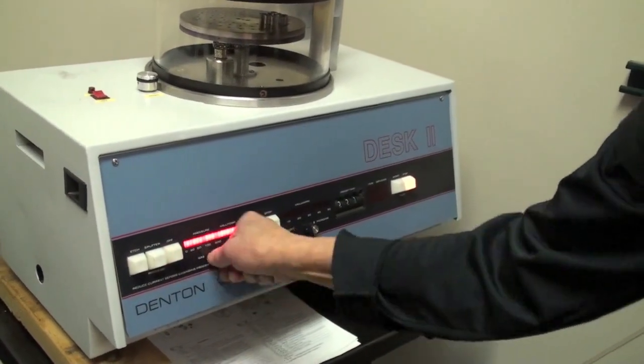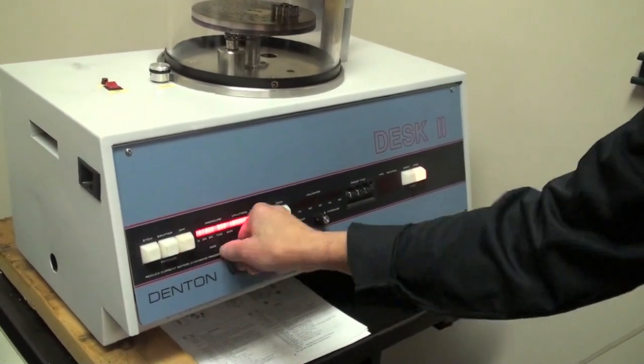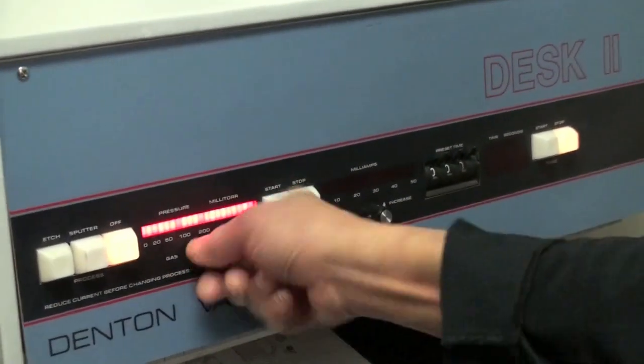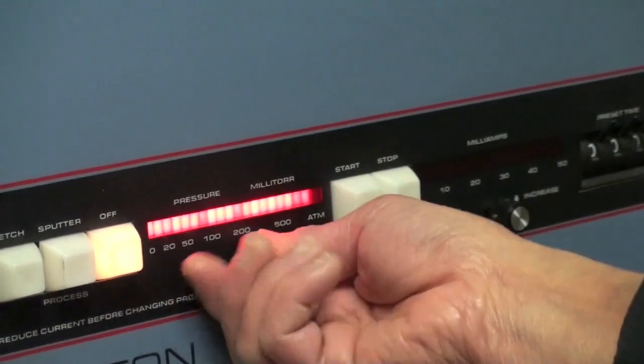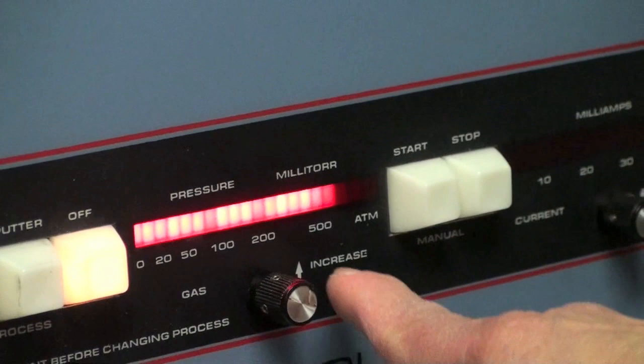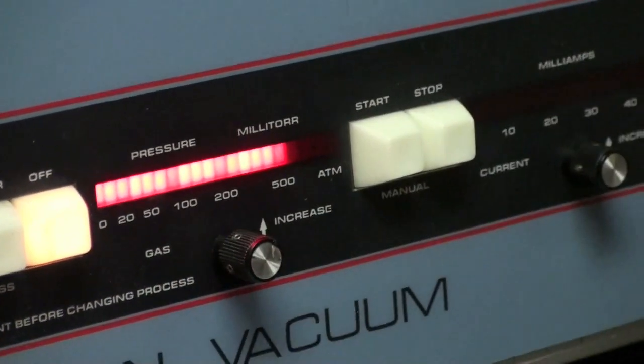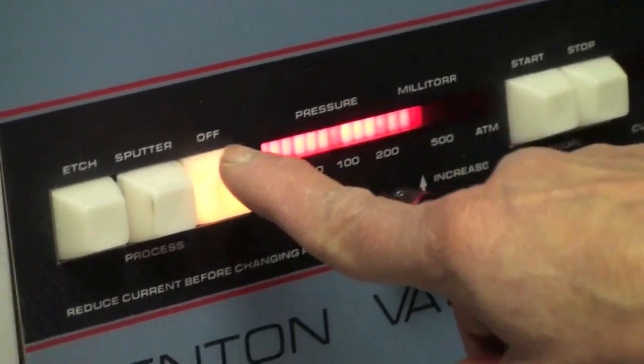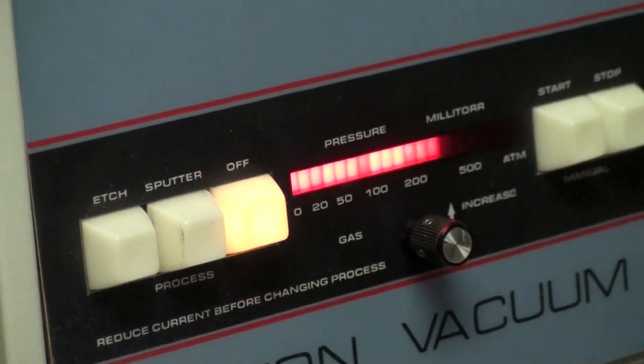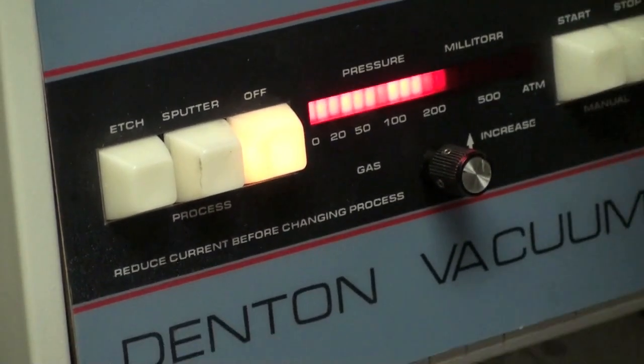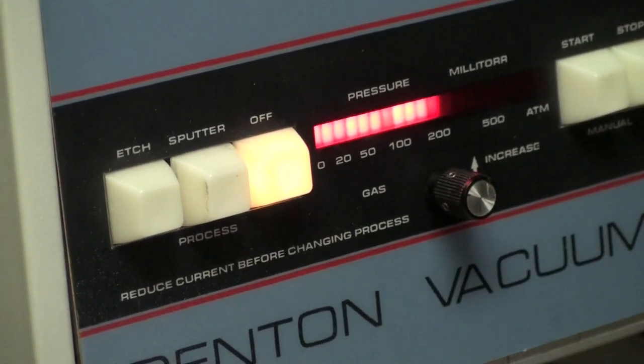This is needle valve, so you have to manually open so that the gas will flow in. So you're turning to the left to open the needle valve. Left open, right close. Whatever it is. Now, if this one is off, it means that there is no channel of gas going to the chamber.